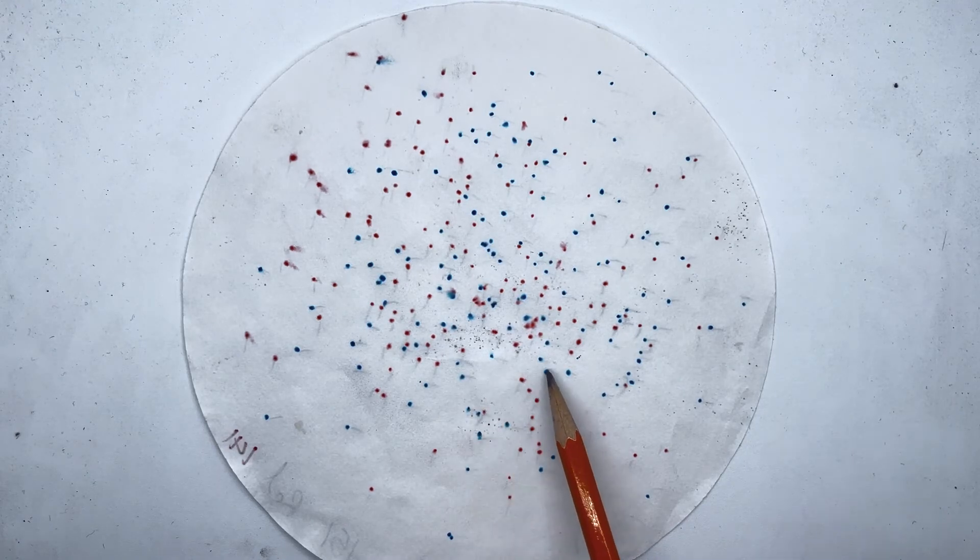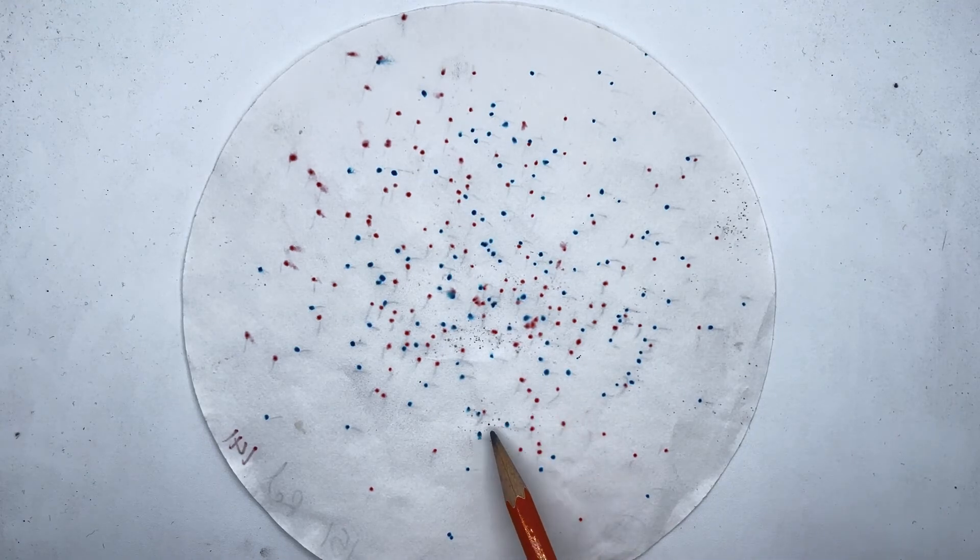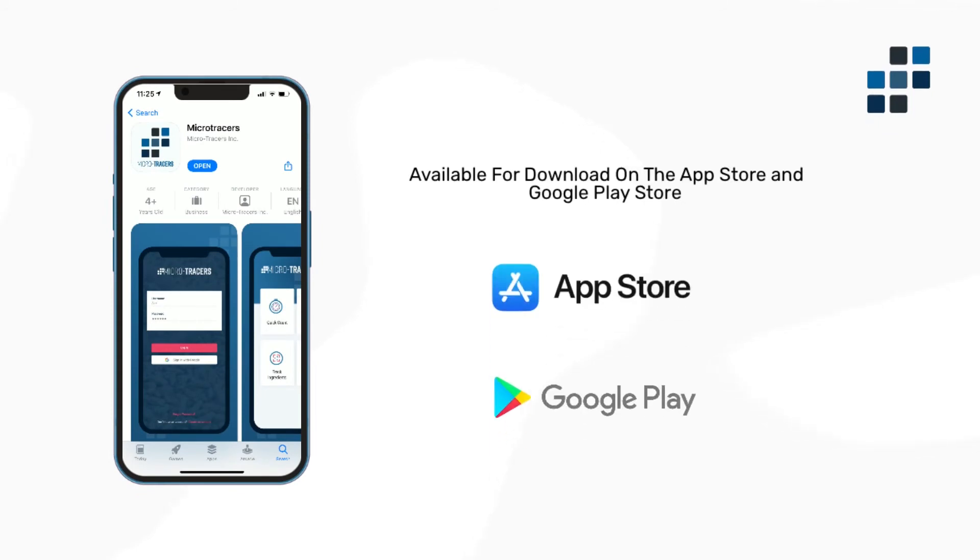With a simple tap, you can count hundreds of dye spots, saving time and money during Microtracer analysis. The spot counting app is available for download on the iTunes and Google Play stores, with detailed and easy-to-follow installation directions.